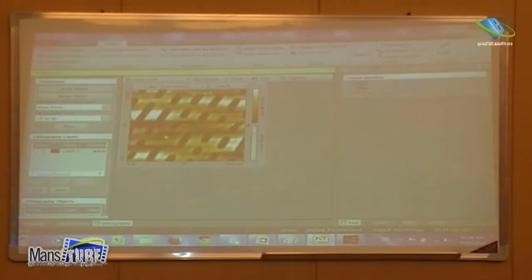Now what we can do, we can import what we draw. And if you think this force is good for me, we can use it. If you need lower force, we can make it lower. If we need higher force, we can keep it higher. If you want, we can stay with this now. This is okay.